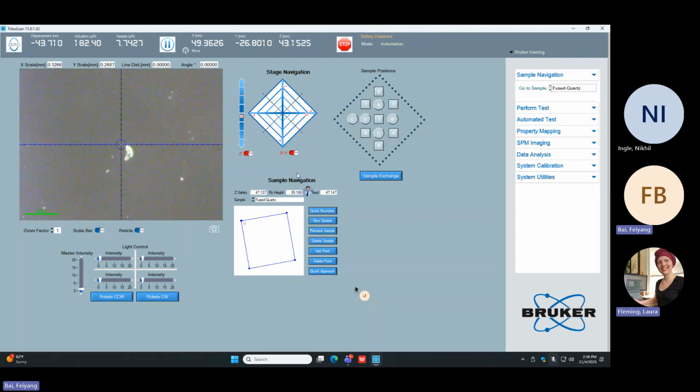Okay, now use the XY coordinates once you're in focus to move. Okay, so this seems pretty good to me. Yeah, it's really hard here in the center. We have a little debris to go with.